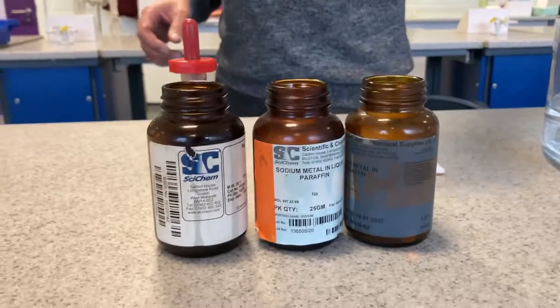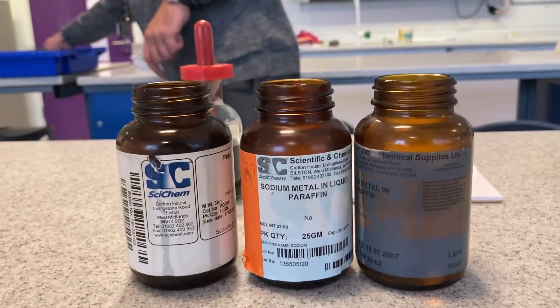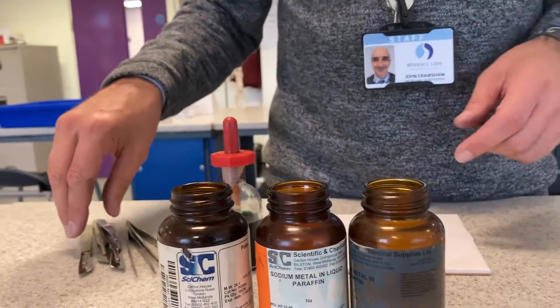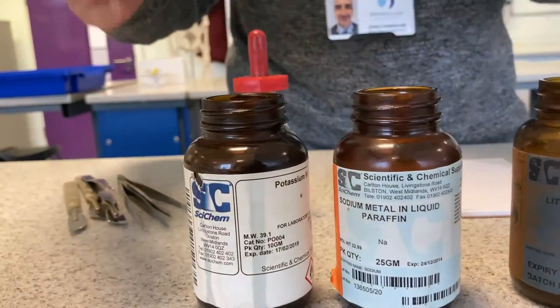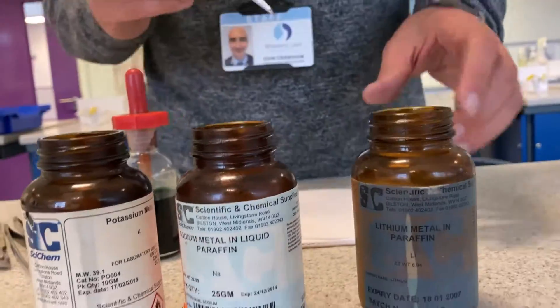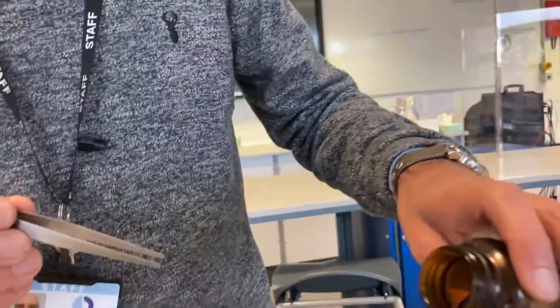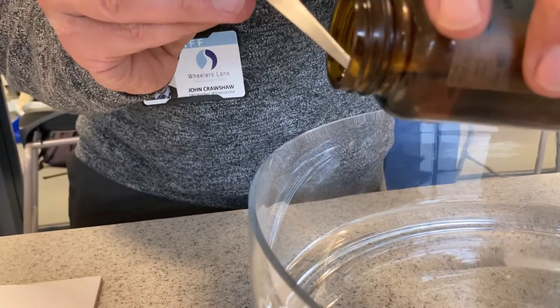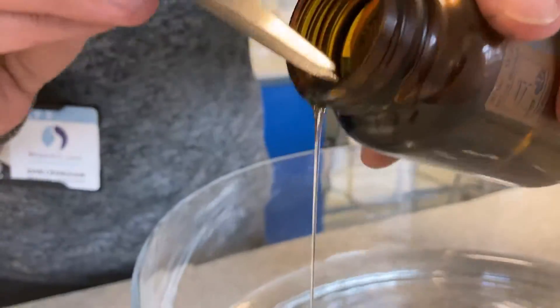I'd like to show you the reactions of several things. They're known as the alkali metals and we have got lithium, sodium and potassium. Now straight away you can see they're in bottles — they don't look like metals. Generally we don't keep metals in bottles. If I just pour a little bit out, this is not the metal. This is — can you see — there is an oil.